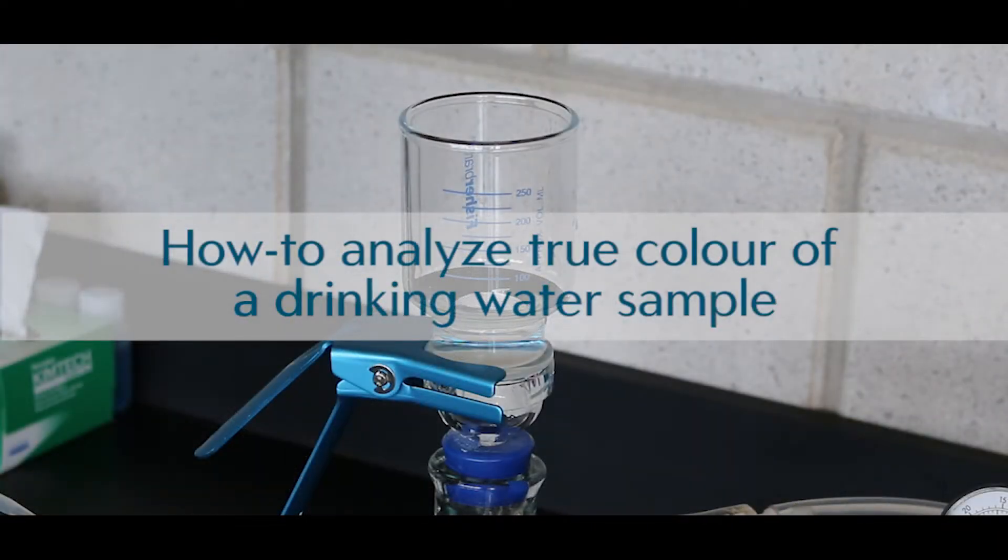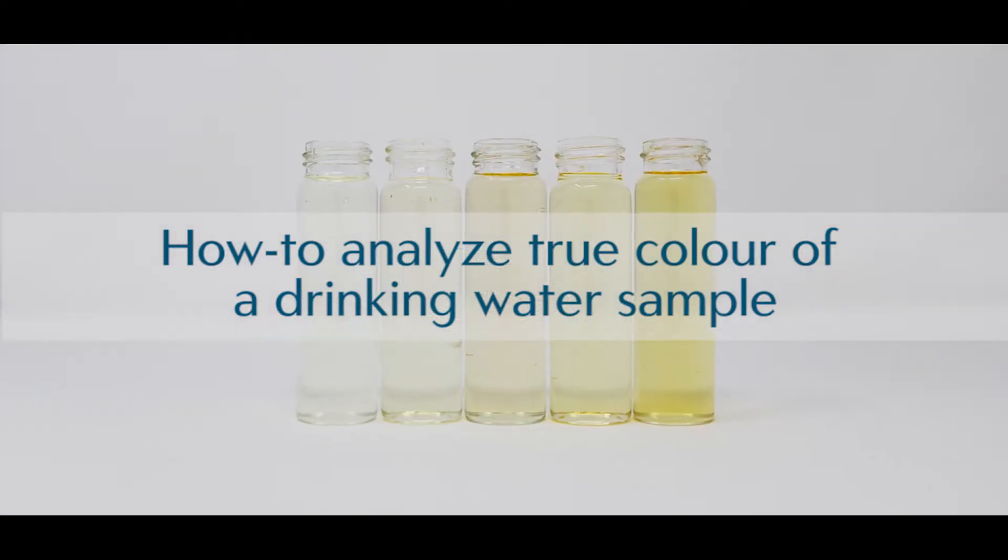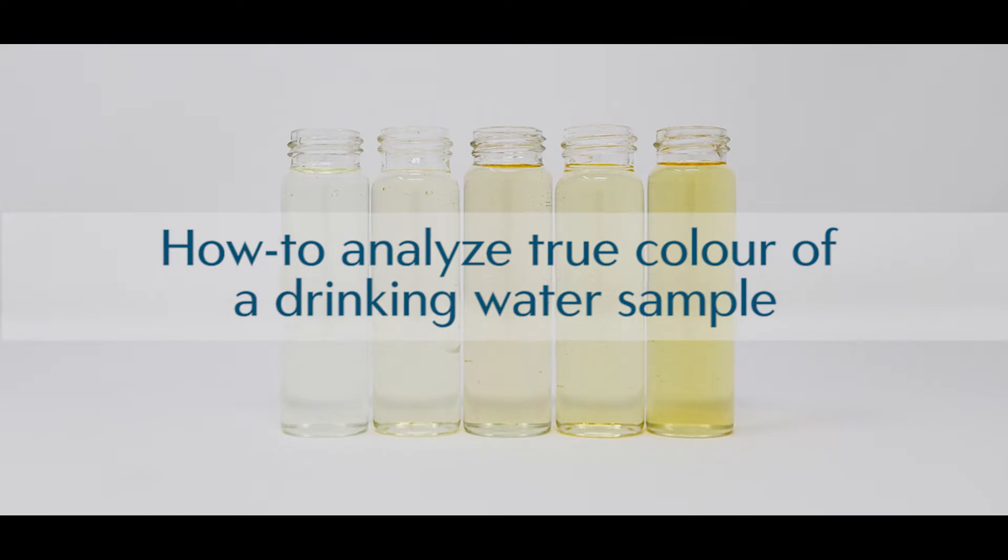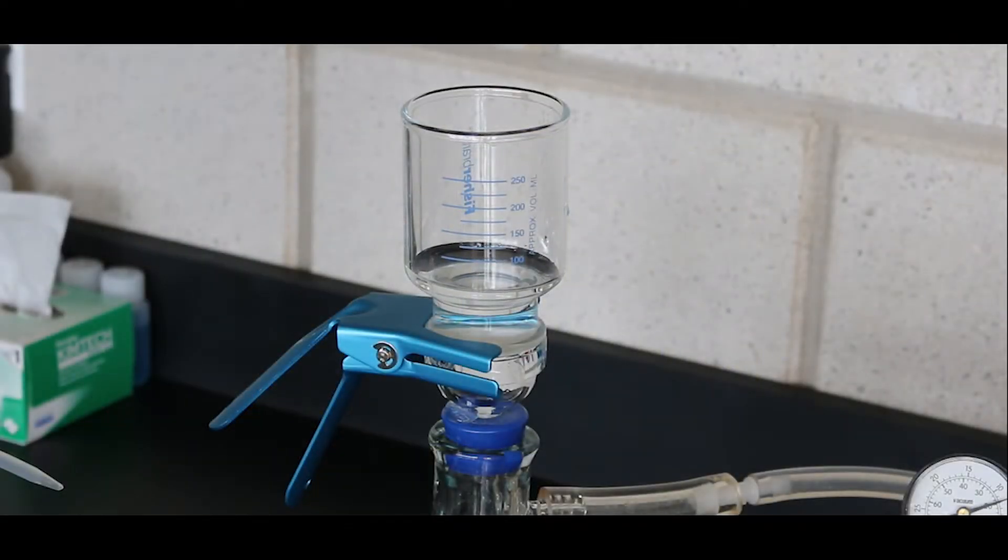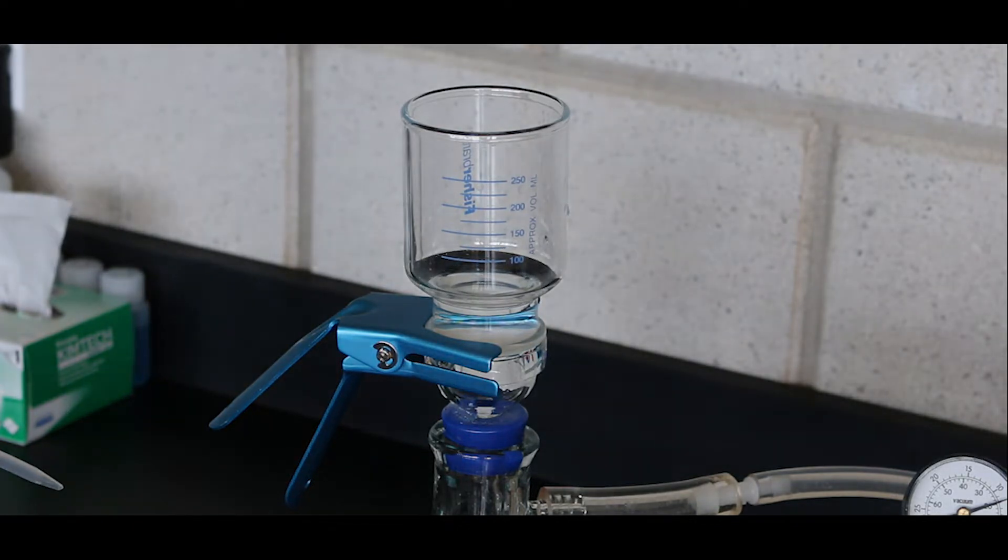This video will demonstrate how to properly analyze the true color of a water sample by the platinum-cobalt standard method. To measure true color, both the blank and sample waters need to be filtered first. Refer to method instructions or watch our video, How to Filter a Water Sample, for guidance.